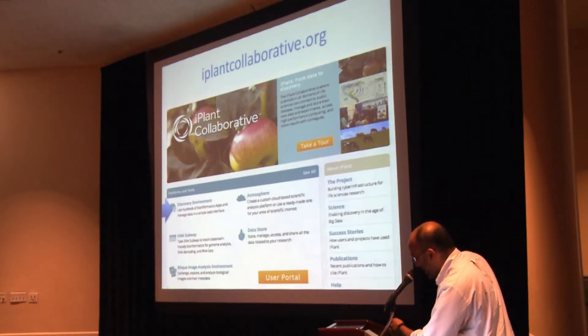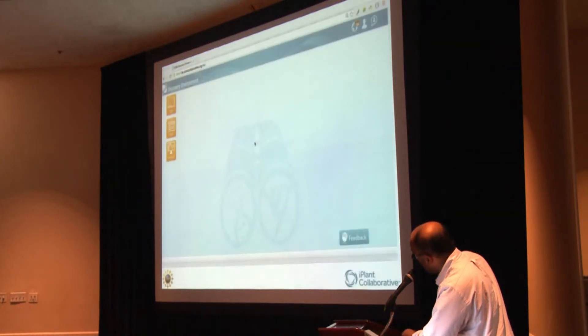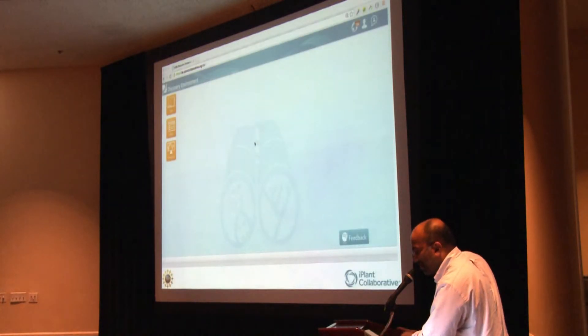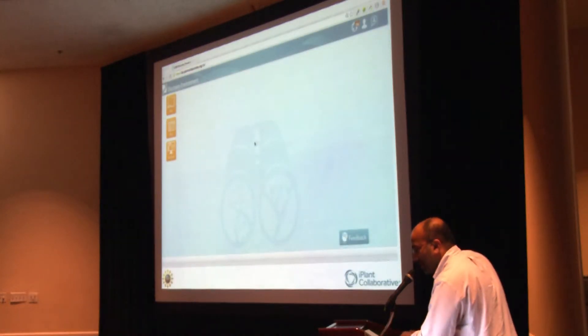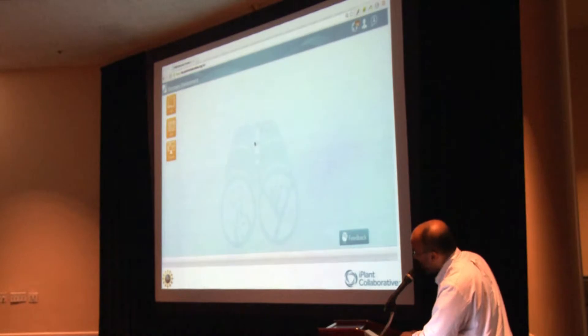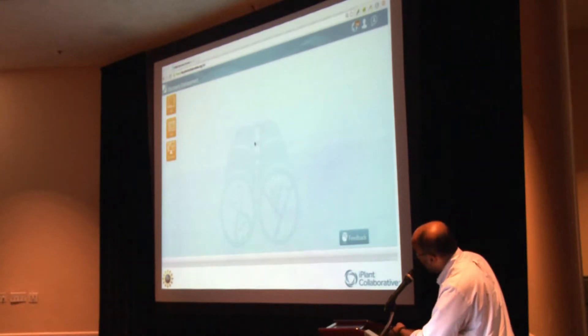And so when you click on that, you don't see this directly. You actually get a login page and you have to enter your login information. And then you see this.